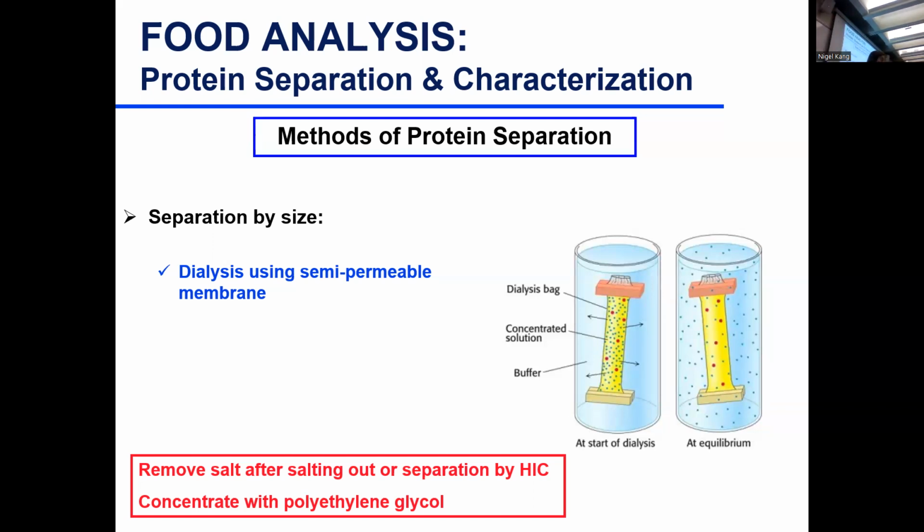So you have your protein solution here. It has carbohydrates, sugars, lipids, ions. With that 3.5 or 1 kilodalton cutoff, usually what can pass through this membrane is like sugars, small molecules, and ions. So what is happening? The concentration of ions or sugars inside the tubing is higher than the deionized water. It's a fresh water. So we assume it has zero sugar or small molecules.